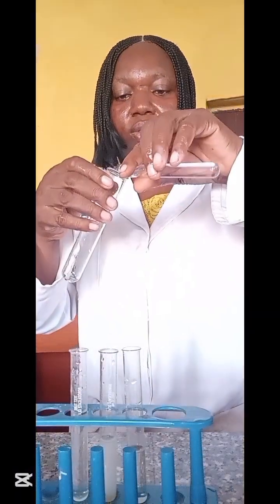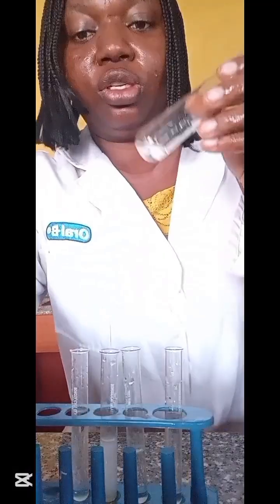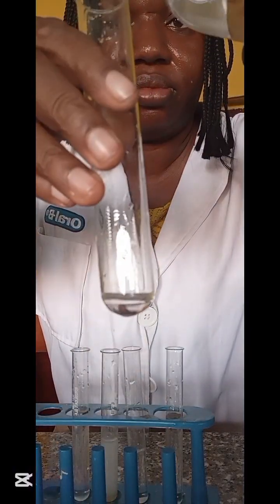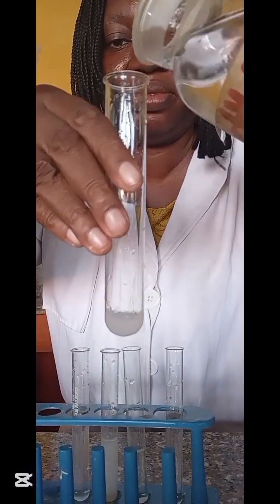Still on the first one, if I put ammonia solution, this is still a white gelatinous precipitate.